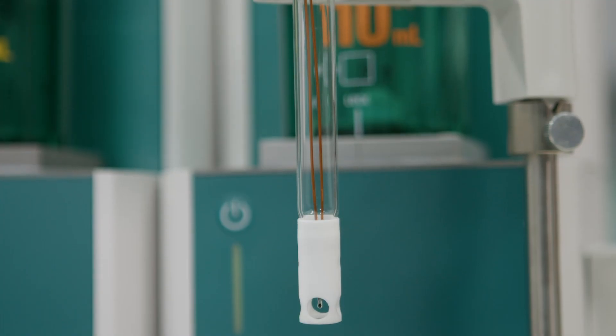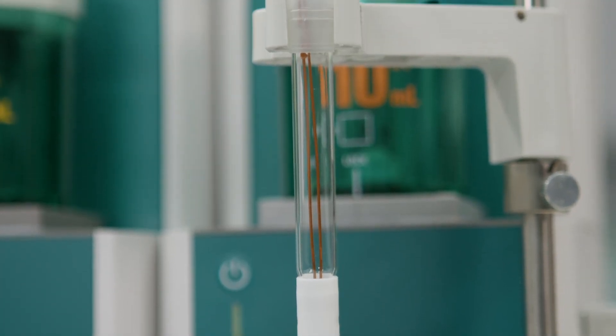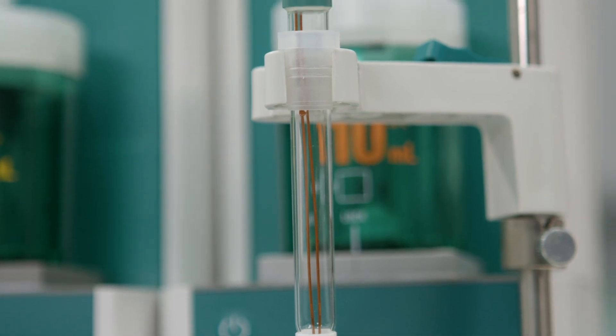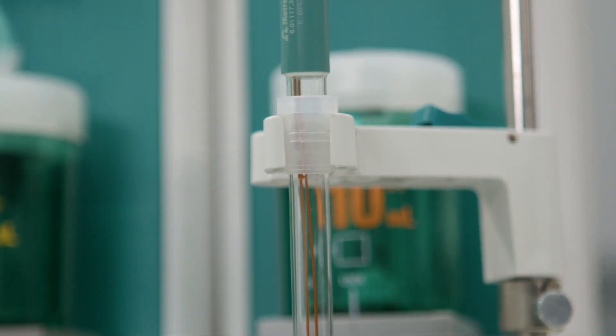All these titrations can be performed with the same sensor, the D-thermoprobe. The D-thermoprobe is maintenance-free. Calibration and conditioning are also not required when using the sensor.